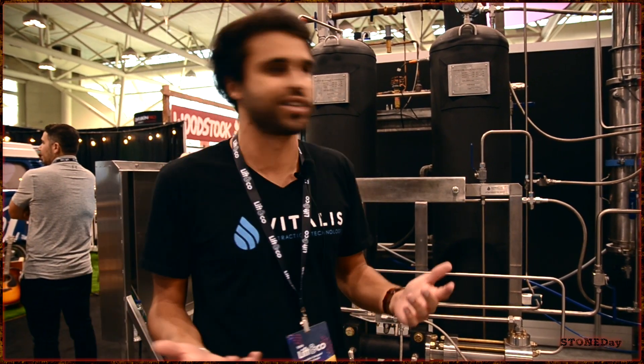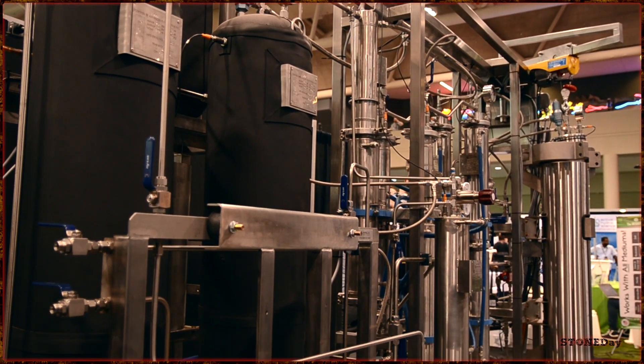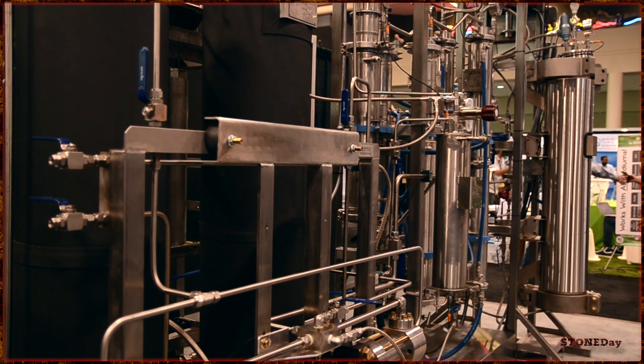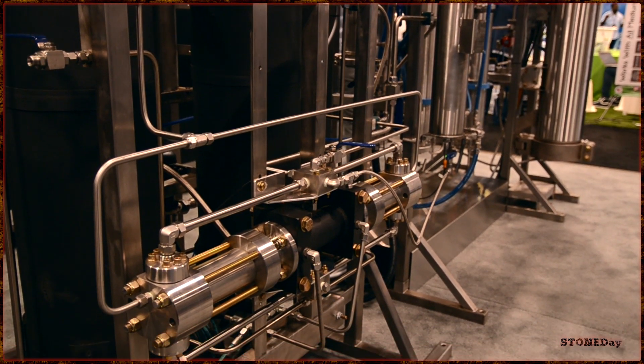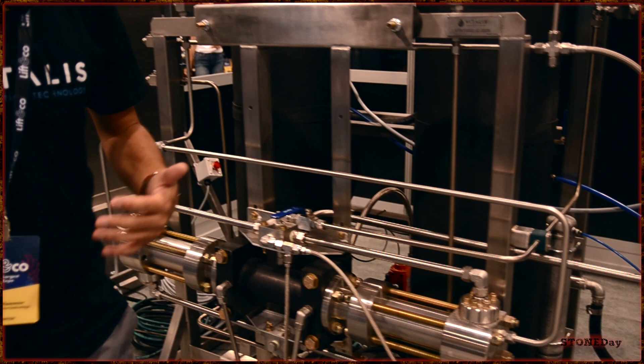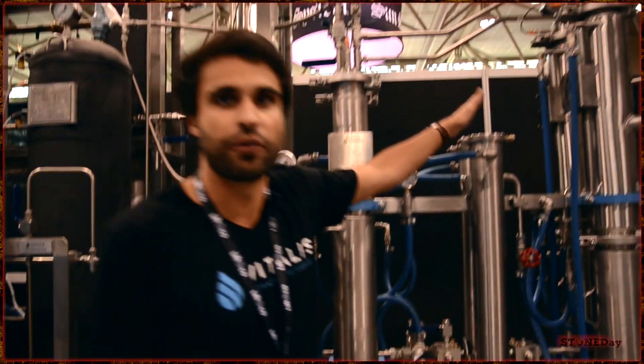Let me give you a quick run through how it works. It all starts here. All the CO2 is stored in these accumulators — we have two 100-liter accumulators that store all the liquid carbon dioxide. We pump it as a liquid because there's a lot more solvent when it's in liquid form than when it would be a gas. This pump is designed to work continuously; it'll pump 15 liters per minute all the way into the first step here.